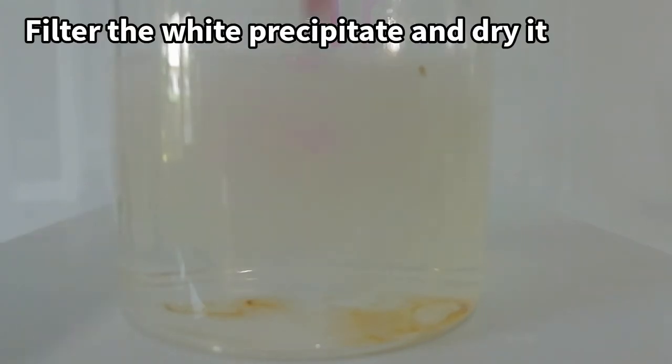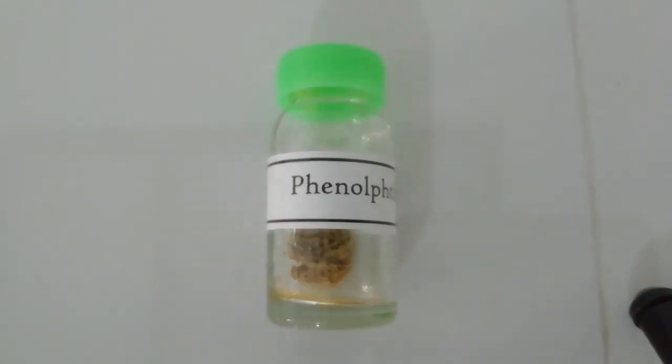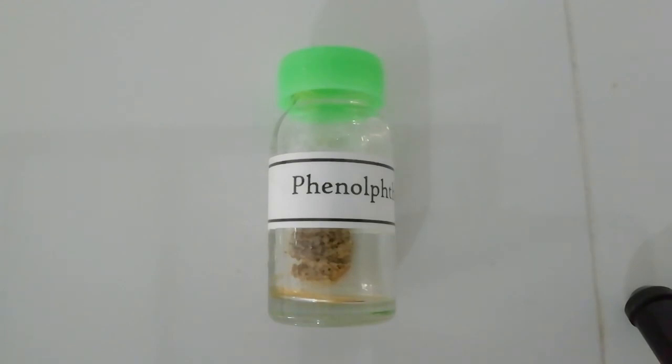Then a white precipitate is formed. That is our final product phenolphthalein. Here is the final product, but it is not white because I think it has some unreacted impurities and side products. Thank you.